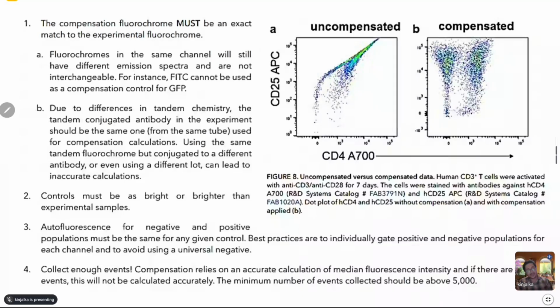It's a marker for HLH, hemophagocytosis, which may be primary or secondary. Often it is associated with immunodeficiency or different cancers. So CD25 is a marker there. Here, compensation is separating the CD4 positives from the CD25 positive ones.